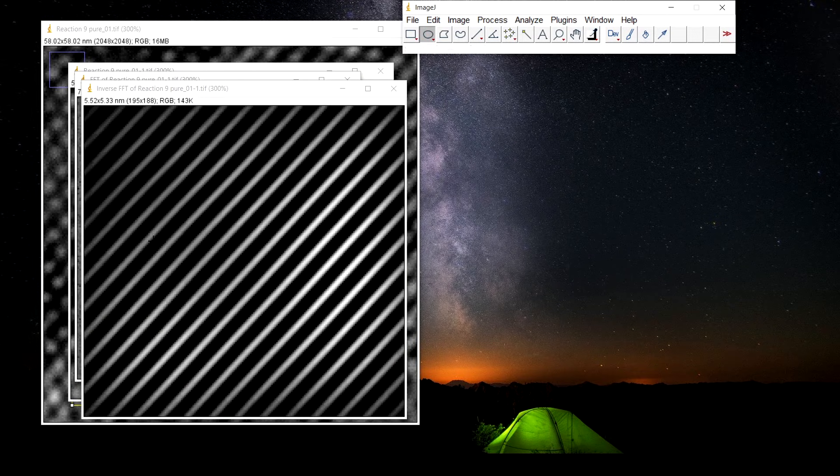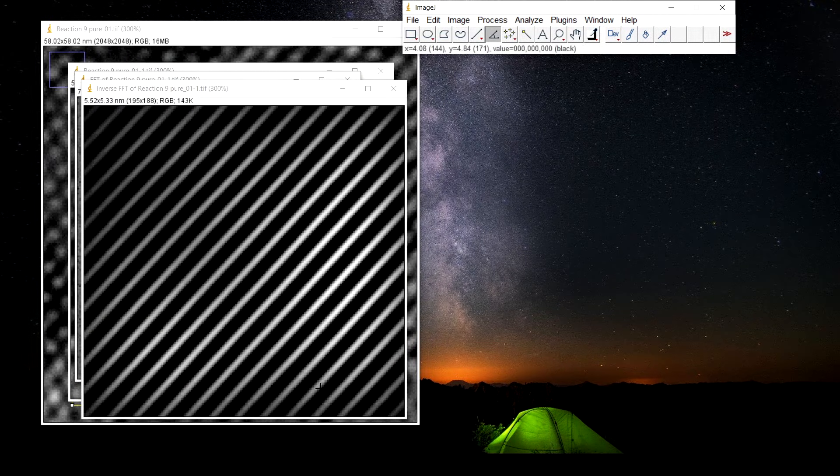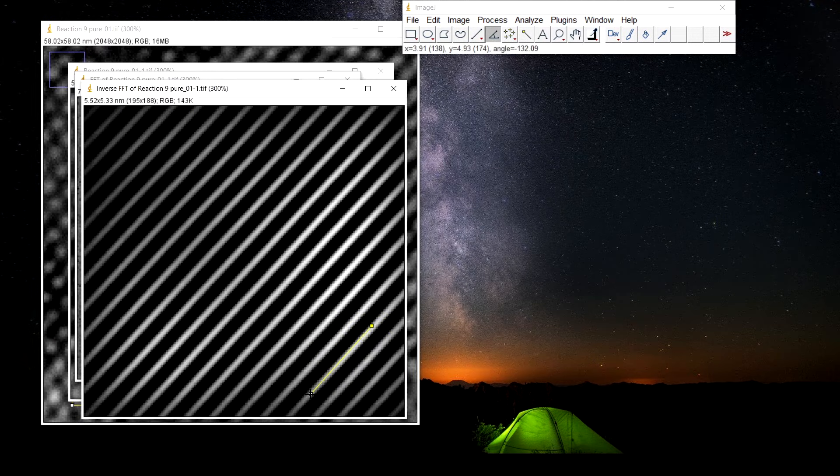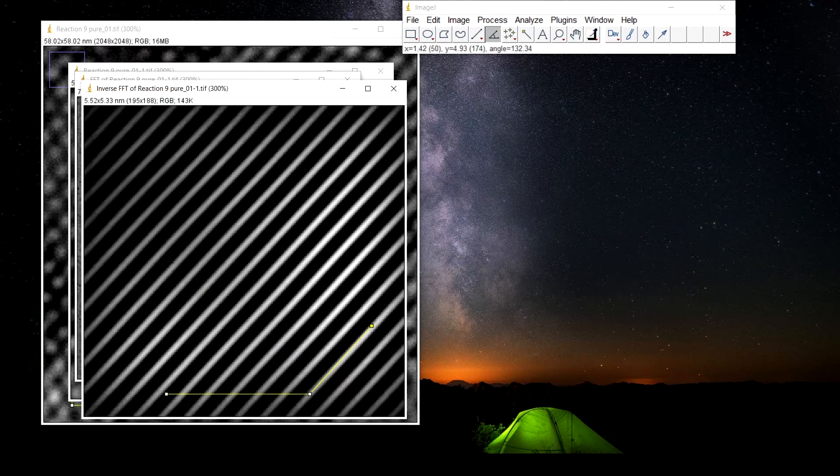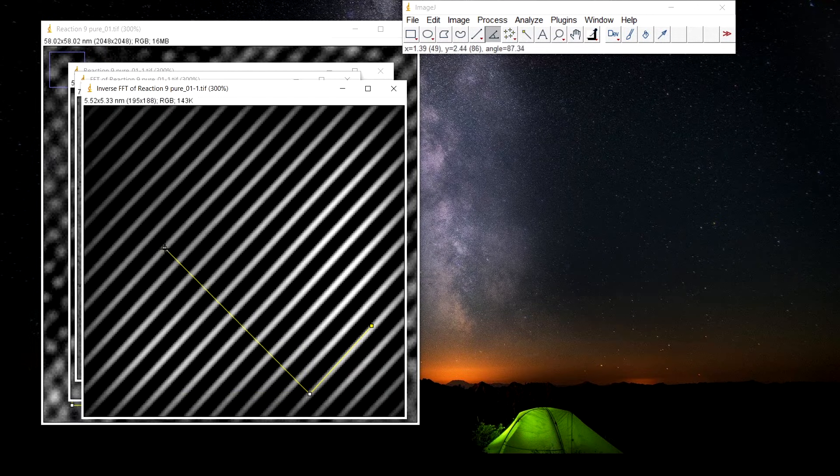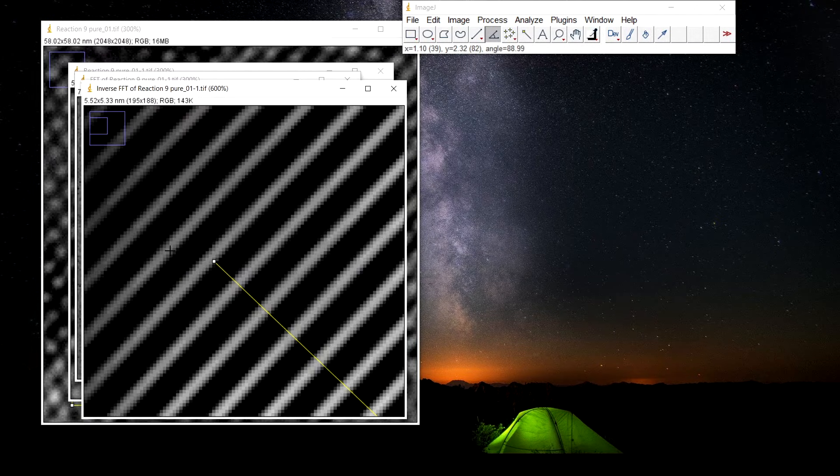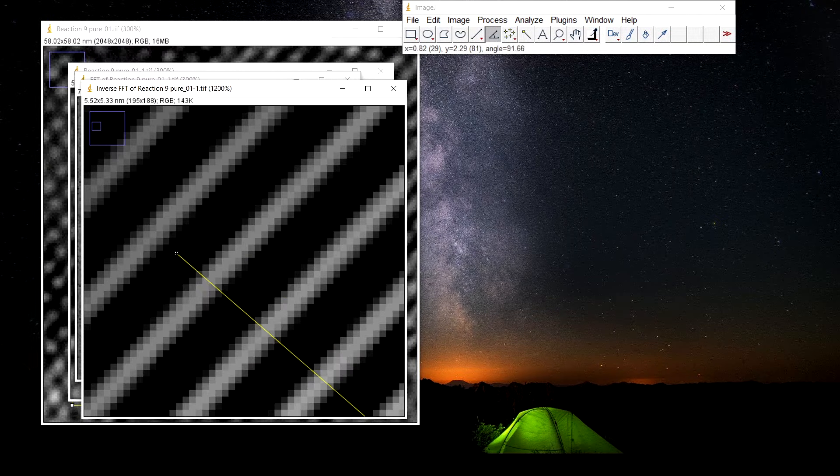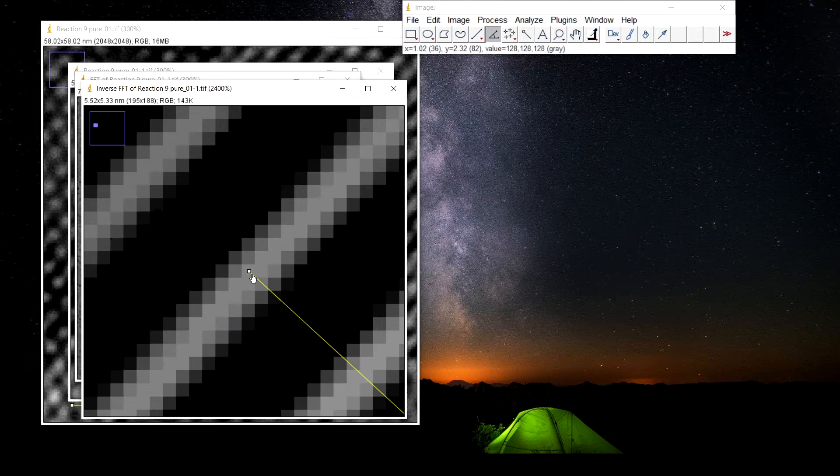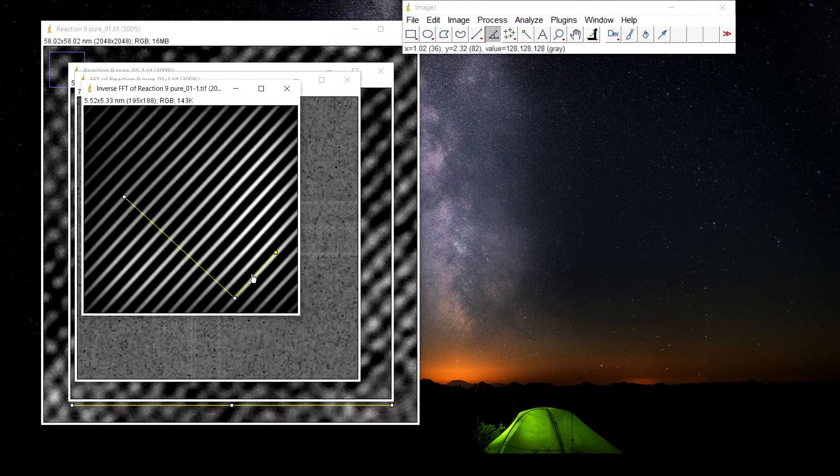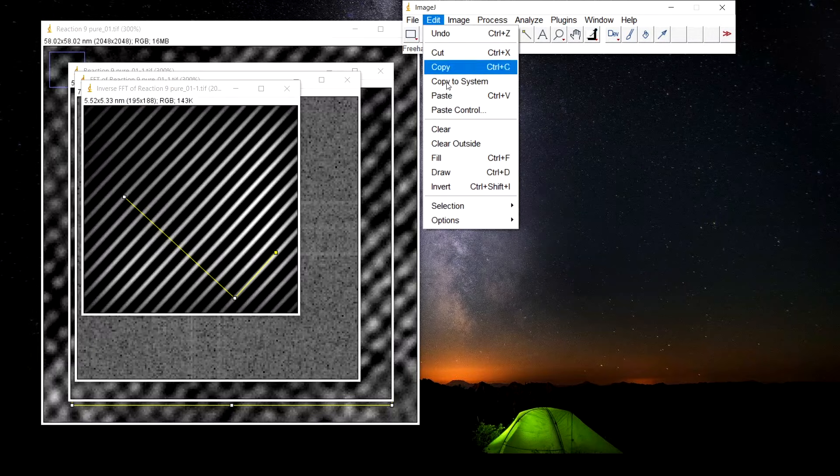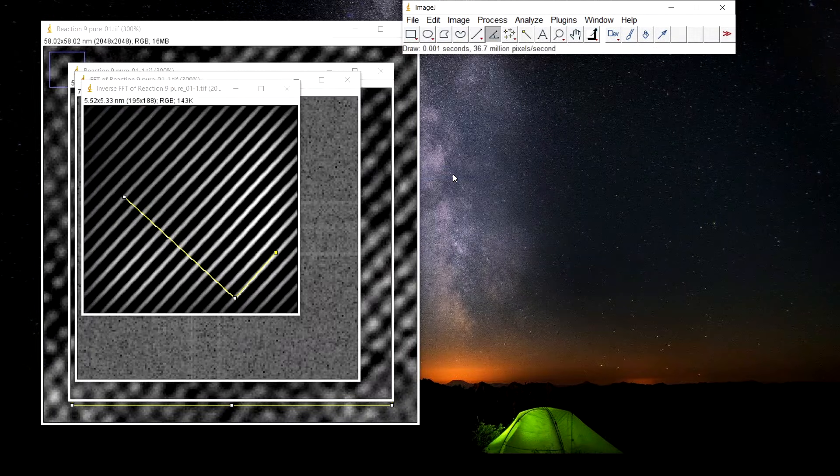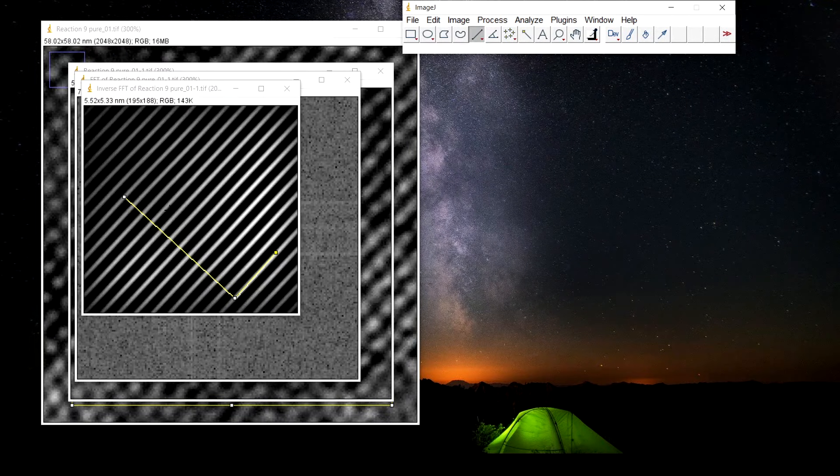Now we need to have a straight line. For this select the angle tool. Edit, draw, select the straight tool.